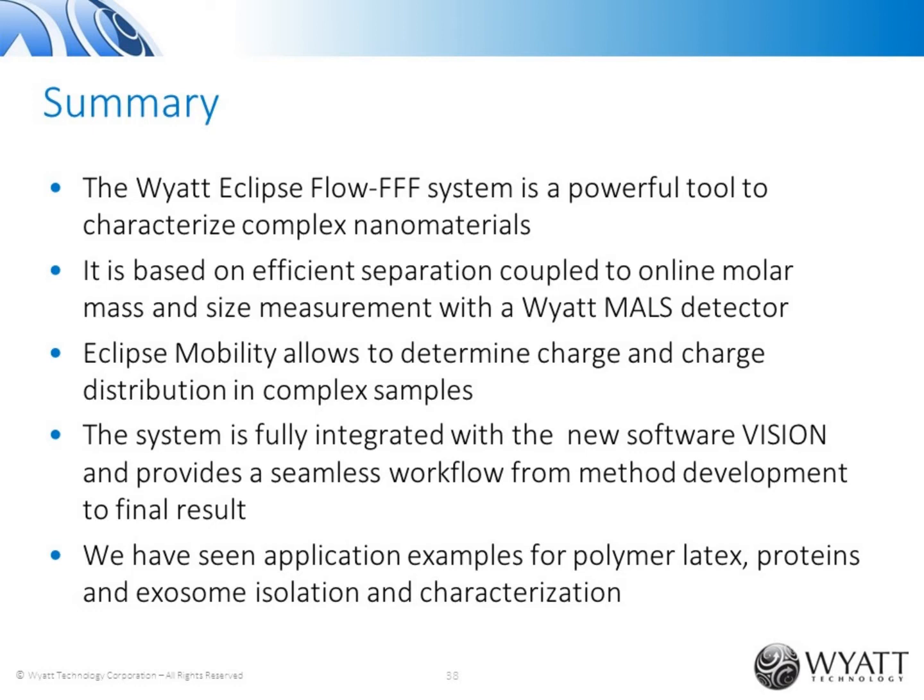Okay, great. Another question I have here is, can we upgrade our Eclipse with the mobility module? Yes, that should be possible. If you have an Eclipse 3 Plus or newer, then it's an easy retrofit. You can add the mobility controller box and the channel, and the software comes with it, and it just adds to your existing system and gives it the capability to measure electrophoretic mobility and use electrical field to modify the separation.